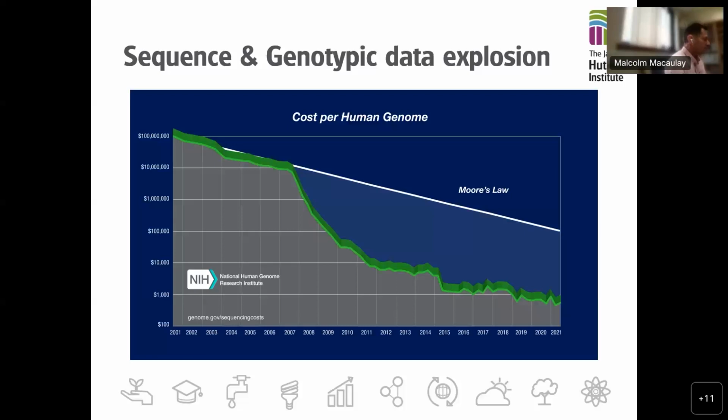But of course, whole genome sequencing is not always required, depending on the questions you want to answer for your project. So genotyping platforms, both low and high throughput, were developed, and they were developed to help reduce genomic and data complexity for researchers. And this led to the requirement to develop software to handle large data sets that were now available to researchers.